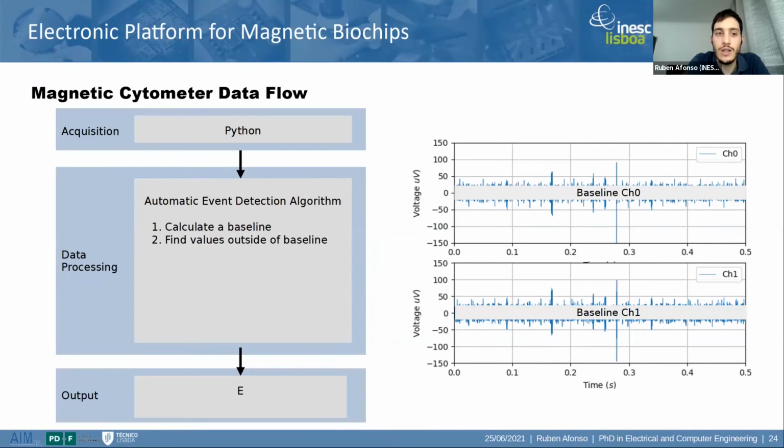However, since we are testing the device each day that we need to make some experiments, in the beginning we will pass through a buffer solution or water just to have a file for that day. For instance, we have a couple of problems with some magnetic interference, and we just use some water to test that and say, okay, we cannot test here today, so just stop it. So this is also one problem.